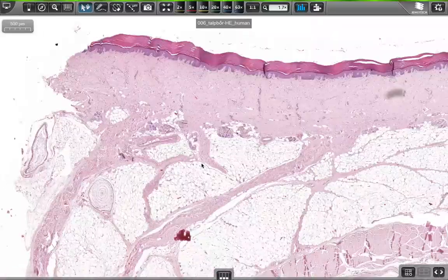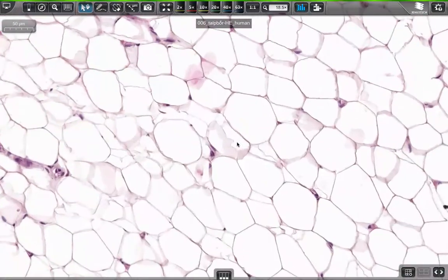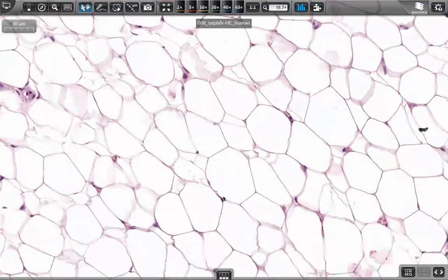And underneath here we can see many adipocytes. The white adipocytes contain only one fat droplet, which is dissolved during the routine histotechnics. So now we cannot see the fat itself, just the space for it is present. And somewhere we can see the nuclei of the cells.